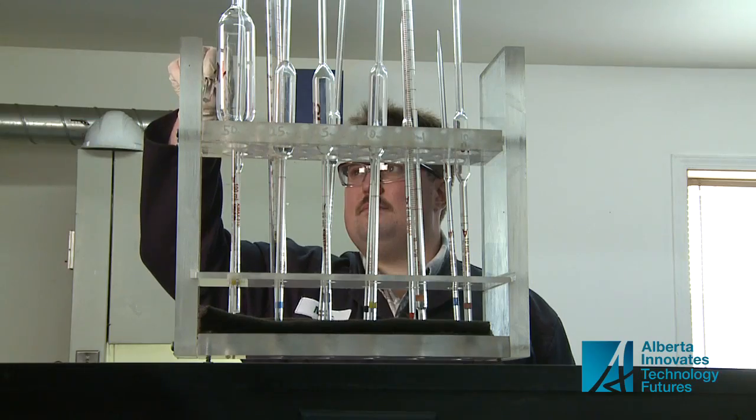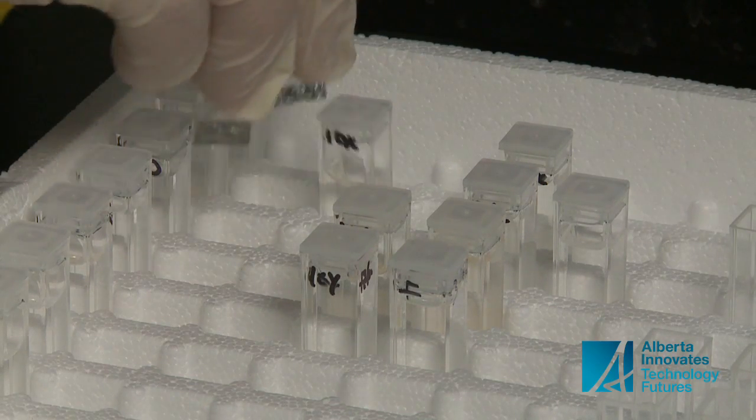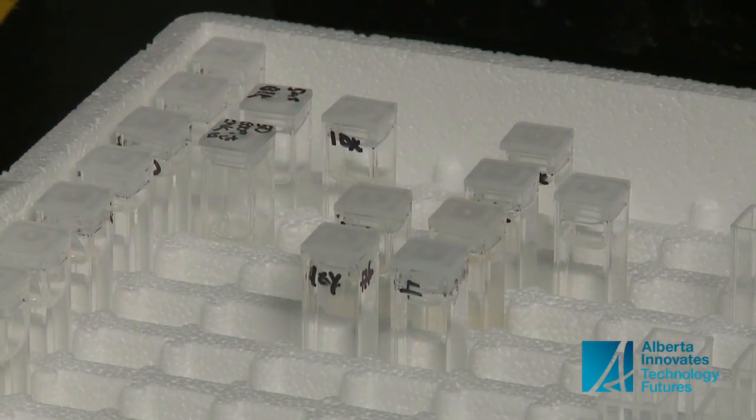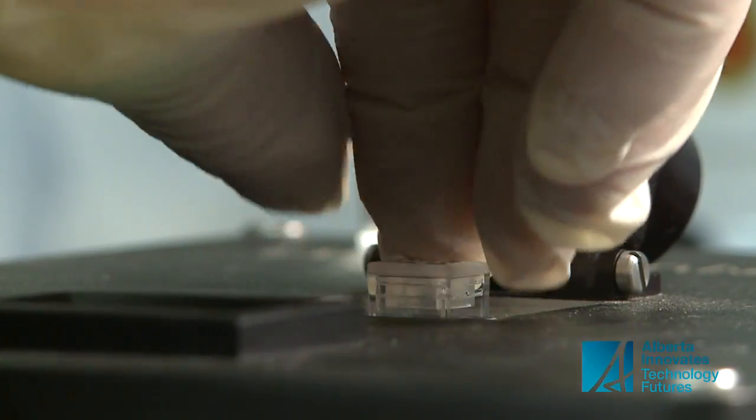Mac Tomachy is testing this water sample for corrosion inhibitors. It's something he does regularly in his job at Caradan Chemicals. It's a fast and simple job, thanks to this unit called a quat box.